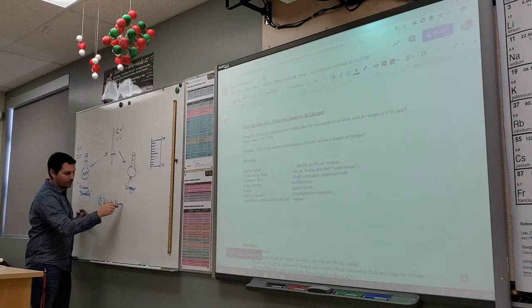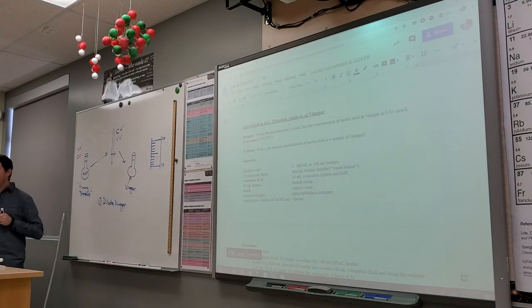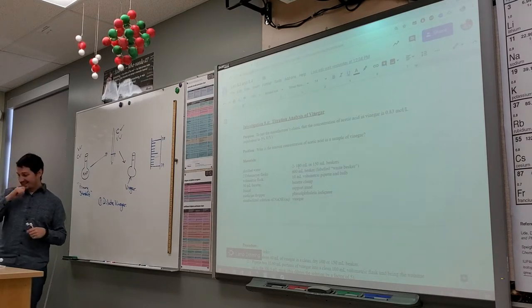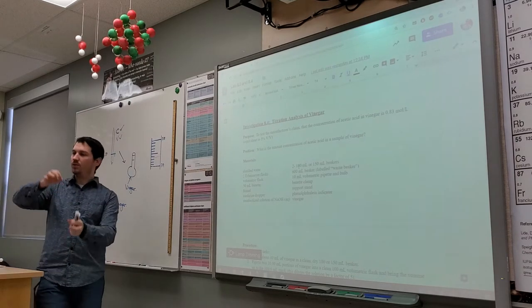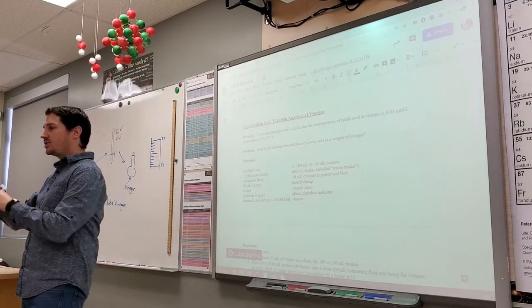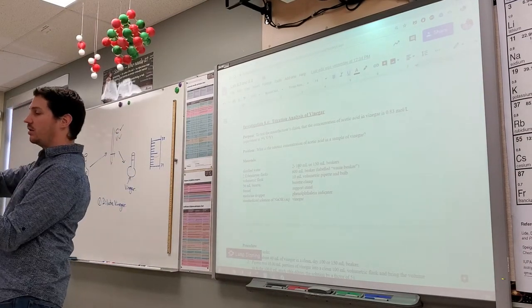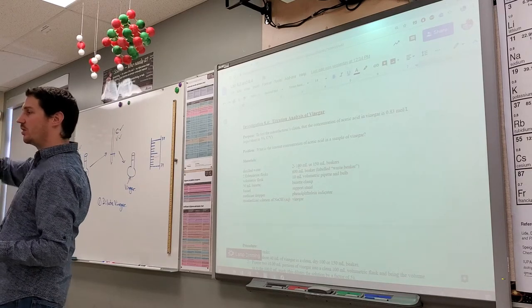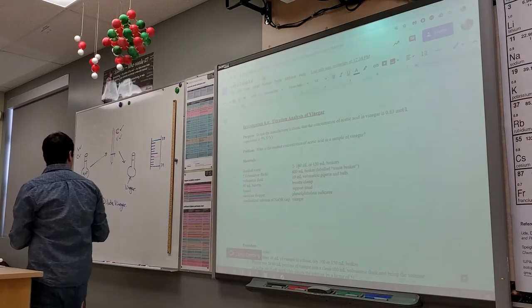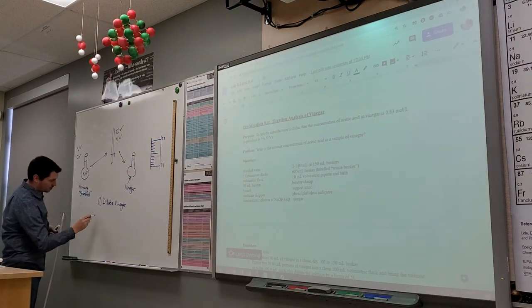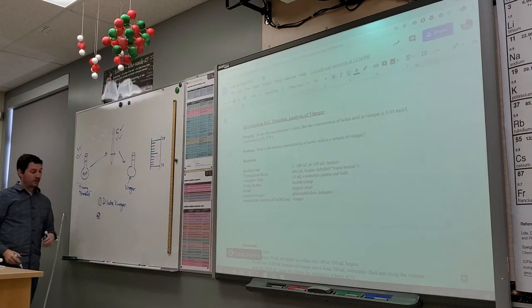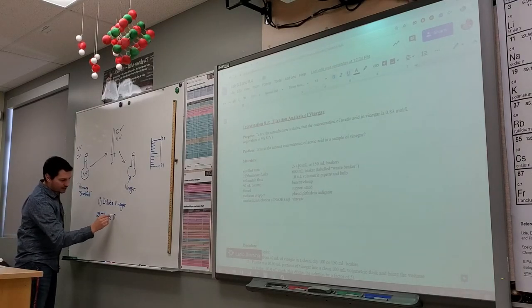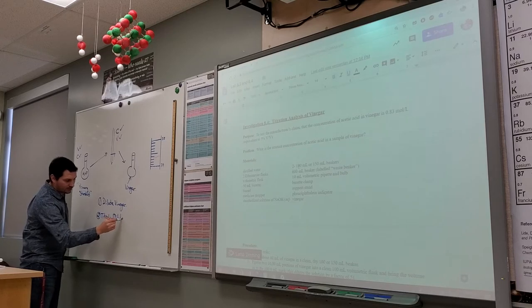We'll dilute our vinegar with a pipette and a volumetric flask. We'll take a 10 milliliter sample out with a pipette, add it to a volumetric flask, add water so it adds up to 100 milliliters, invert it a couple times. Then we're going to titrate our dilute vinegar.